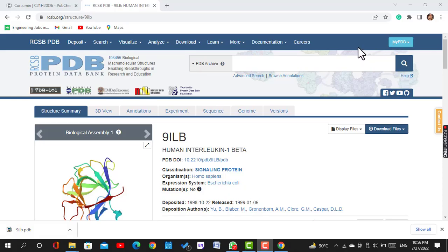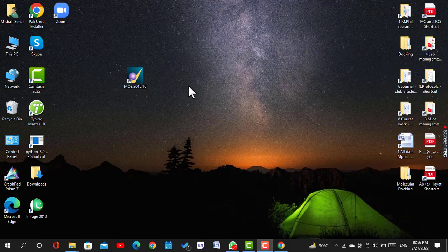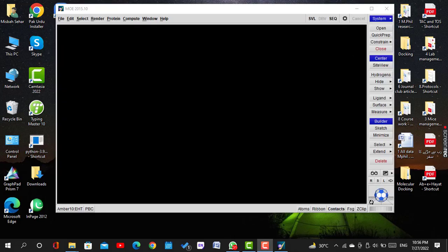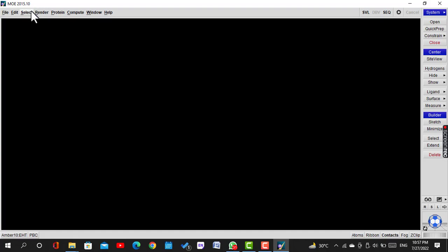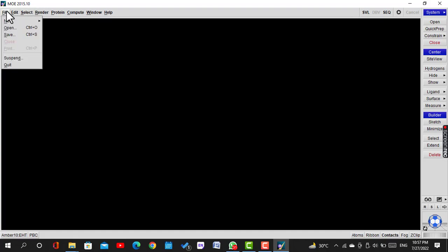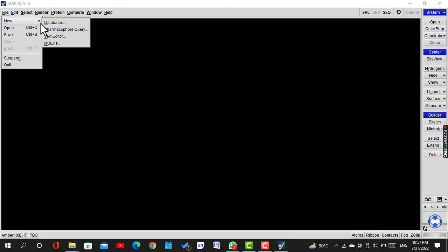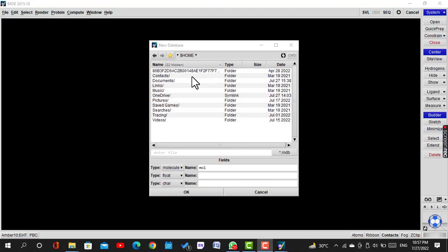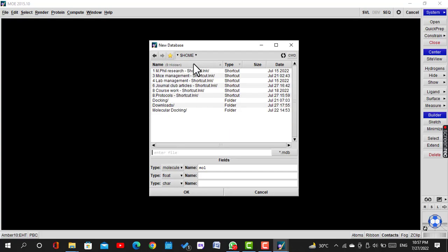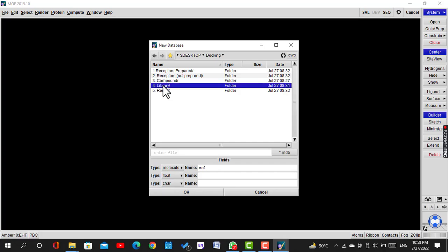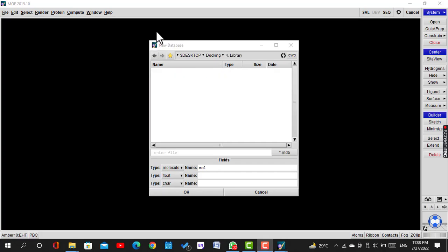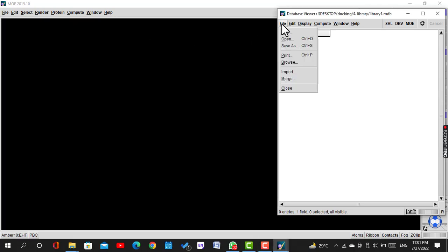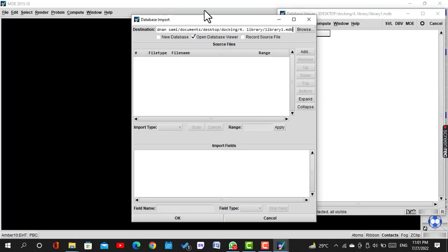Now we will make a library of compounds. For this purpose, we open MOE software. We click on File, then New, then Database. We save the library in the folder present on the desktop with the name Library 1. In this library, click on File, then Import.